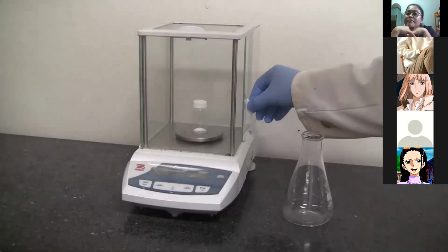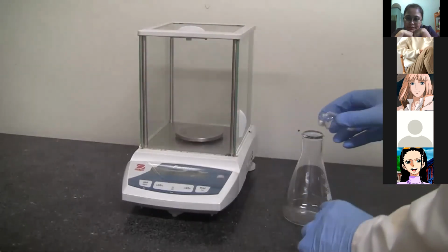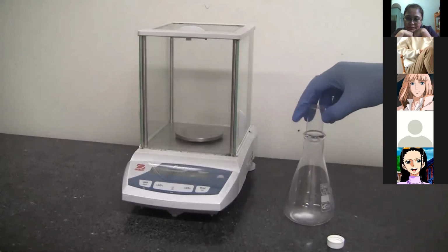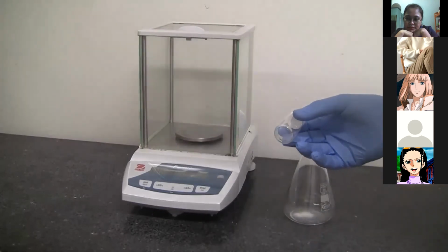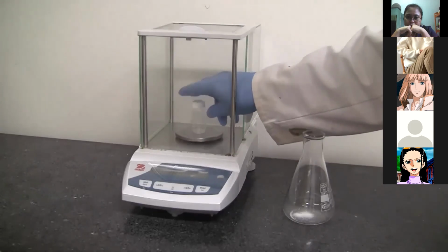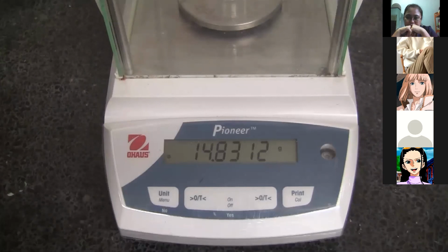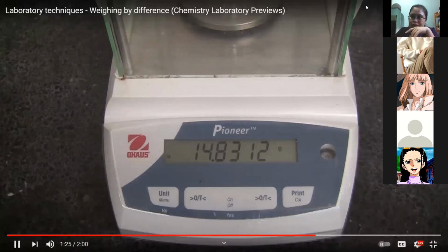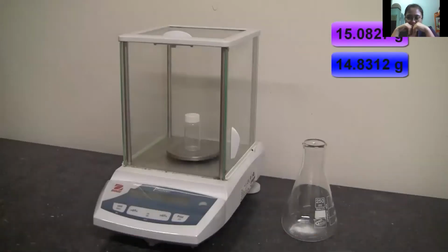Once you've recorded that mass, slide the door open, take your sample out and carefully transfer it into the flask that you're going to be working with. Make sure that you don't lose any on the transfer, so right inside the neck here. Pop the lid back on, there'll still be a little residue left in your vial, that's just fine. Make sure the balance still says zero, pop the vial back in and take the reading again, all 4 decimal places. This is called weighing by difference because the difference in mass between what you had earlier and what you have now will be the mass inside your flask. So you now know the exact mass that you've weighed by difference.